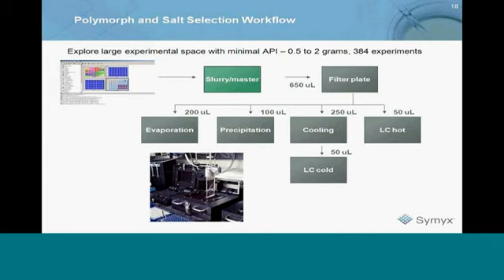So you end up with a set of samples that you can analyze with microscopy. You can analyze it with Raman. You can analyze it with X-rays. You get a full characterization on that. All those are non-destructive types of tests. So one can even take those.